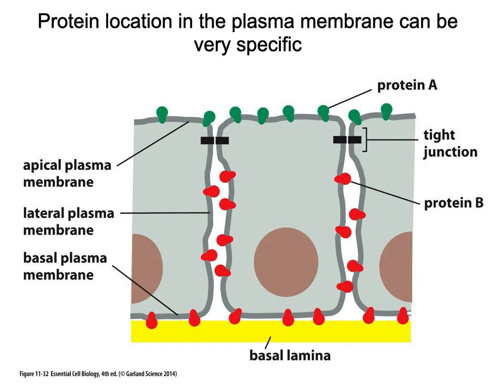So they're now inactive, and this allows us to look at dynamics as far as proteins moving around in the plasma membrane, so how that recovery happens as these damaged fluorescent proteins move out of the area, and active fluorescent protein tagged to the protein of interest moves into that location.